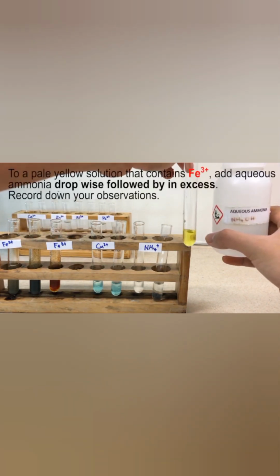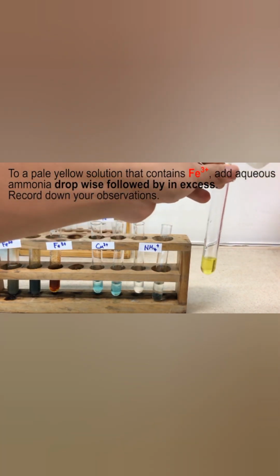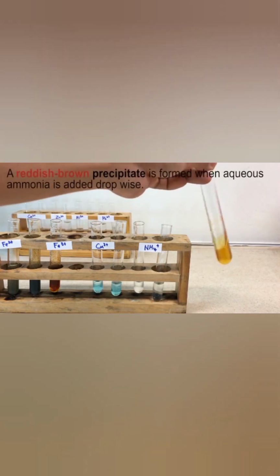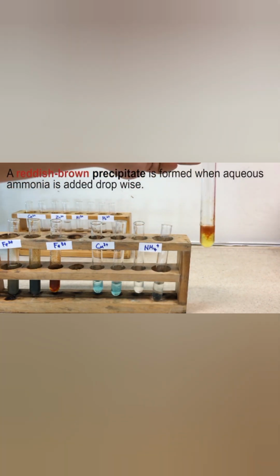Okay, let's use aqueous ammonia. Adding aqueous ammonia in drops to a pale yellow solution that contains iron 3. Let's see what the observations will be. Okay, you've seen it. A reddish brown precipitate is formed when aqueous ammonia is added in drops.